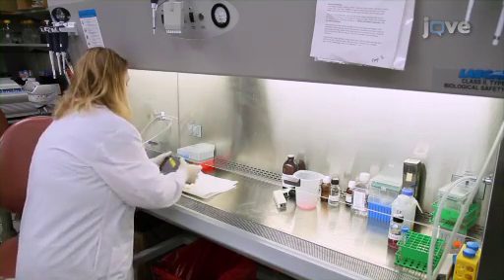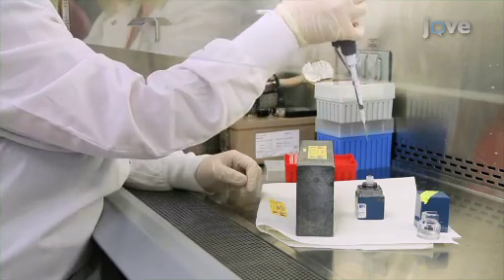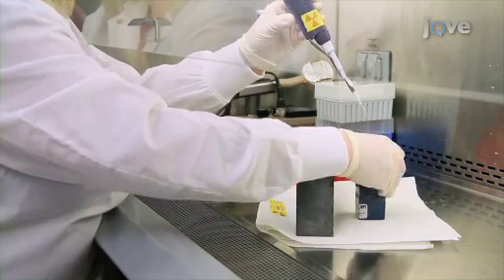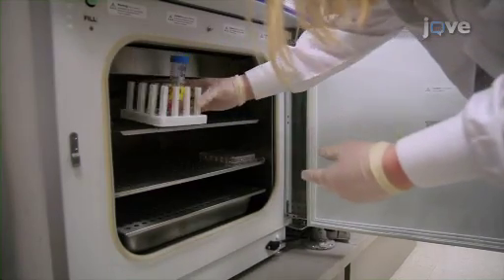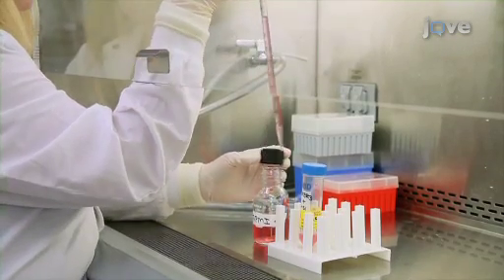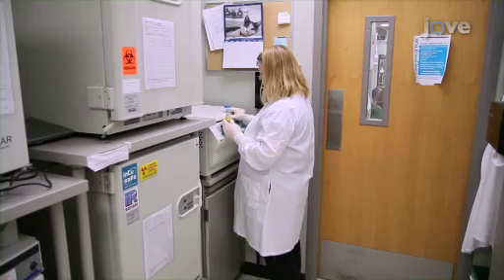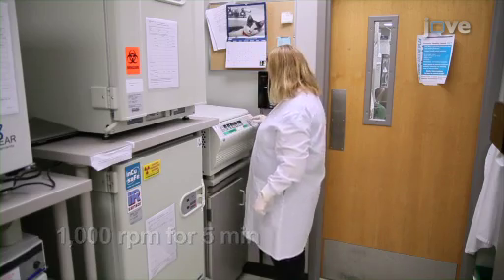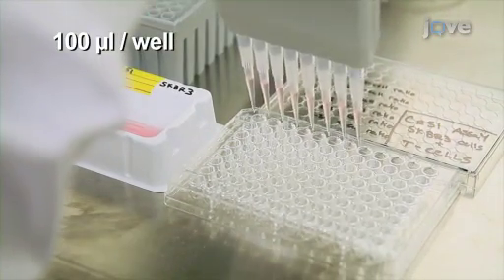Always follow institutional radiation safety procedures when working with chromium-51 and chromium-51-labeled target cells, and use appropriate shielding to reduce radiation exposure. Begin by pulsing tumor cells for 2 hours at 1 million cells per milliliter with 10 microliters per milliliter of fresh chromium-51. Next, wash the tumor cells in 10 milliliters of RPMI media with 10% FBS. Centrifuge the cells and reconstitute them in the same media at 1 million cells per milliliter. Then, to a 96-well round-bottom plate, add 100,000 tumor cells per well.